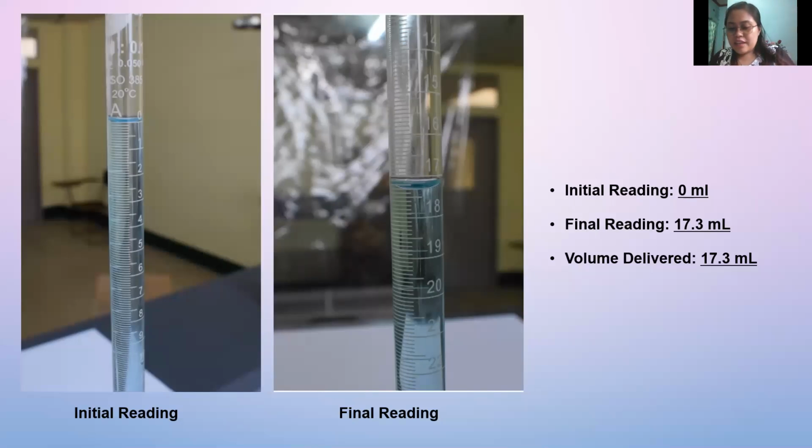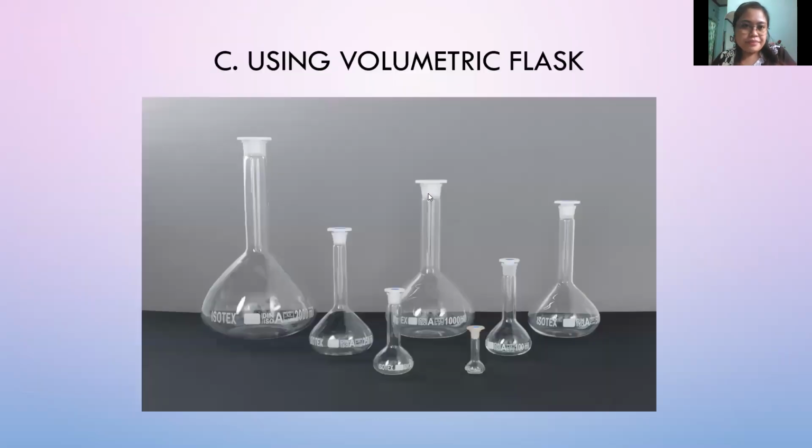So sa burette class, it is not really necessary to start with 0 kasi you can still get the volume being delivered even if you start anywhere in the burette. Okay? Minus lang nato. So the volumetric flask, you are very much familiar with this.